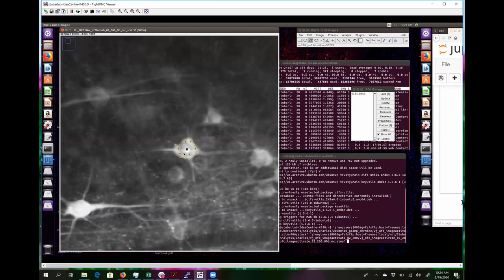In those cases it's actually very tricky. You'll have to go the extra mile to make sure that your motion correction is perfect. In this case, notwithstanding that, I still try to go the extra mile to make sure that the motion correction is perfect. So just keep in mind that the level of motion correction that you need will sort of depend on your question.